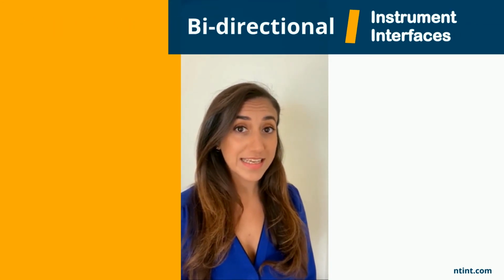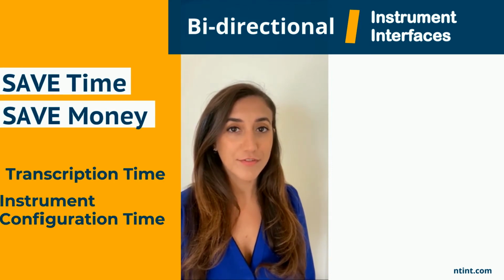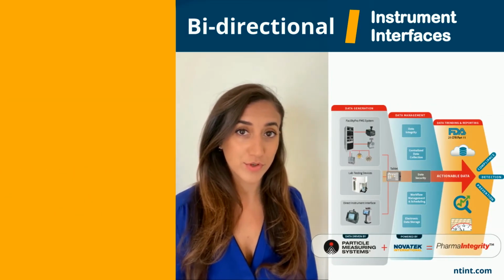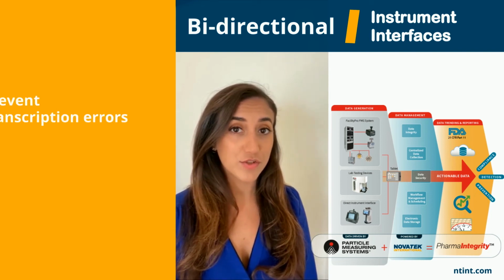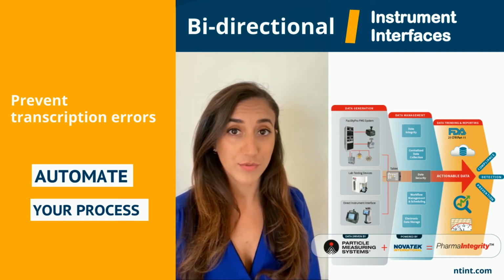By offering a bidirectional instrument interface, Novatek's EM solution saves you both transcription time and the time required to configure your instruments, such as your air samplers and your particle counters. It also prevents transcription errors by automating the process of transferring results.